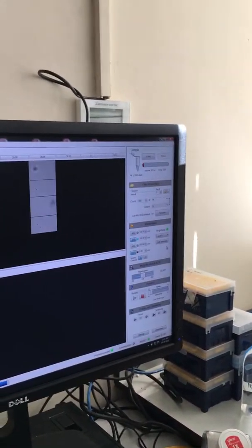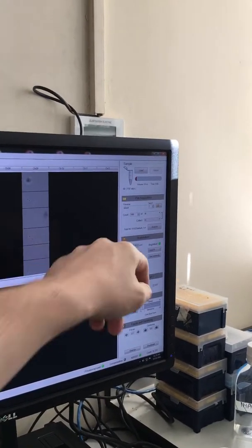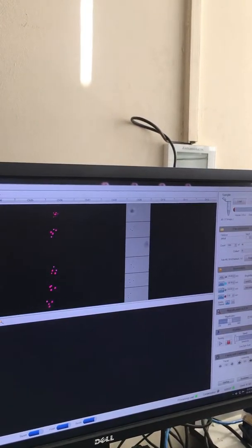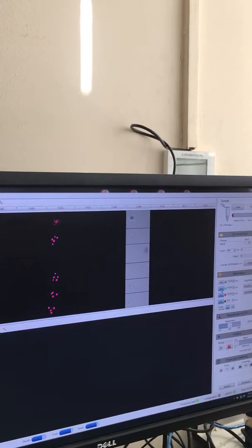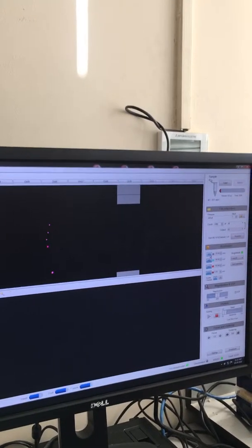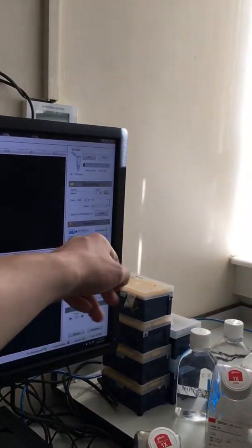Then you want to press which lasers you want, so 405 and 642, turn them all on. Live Dead's on 405, I think. So hit 405. You don't need the other one, leave it there, it doesn't matter. Hit set intensity.